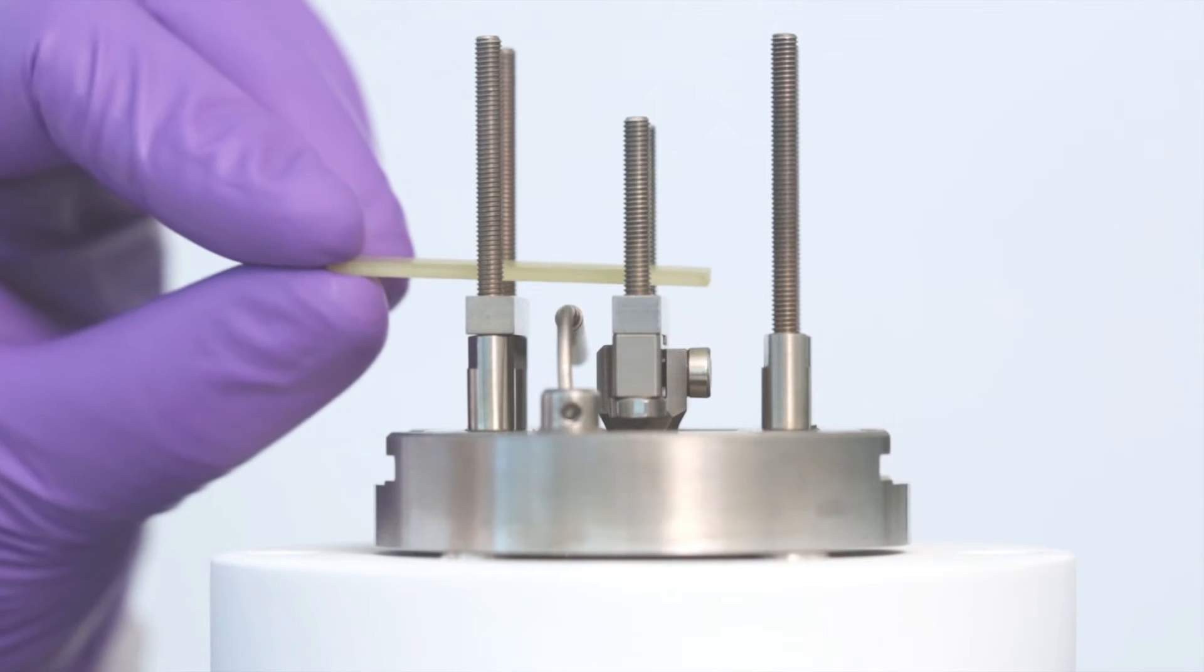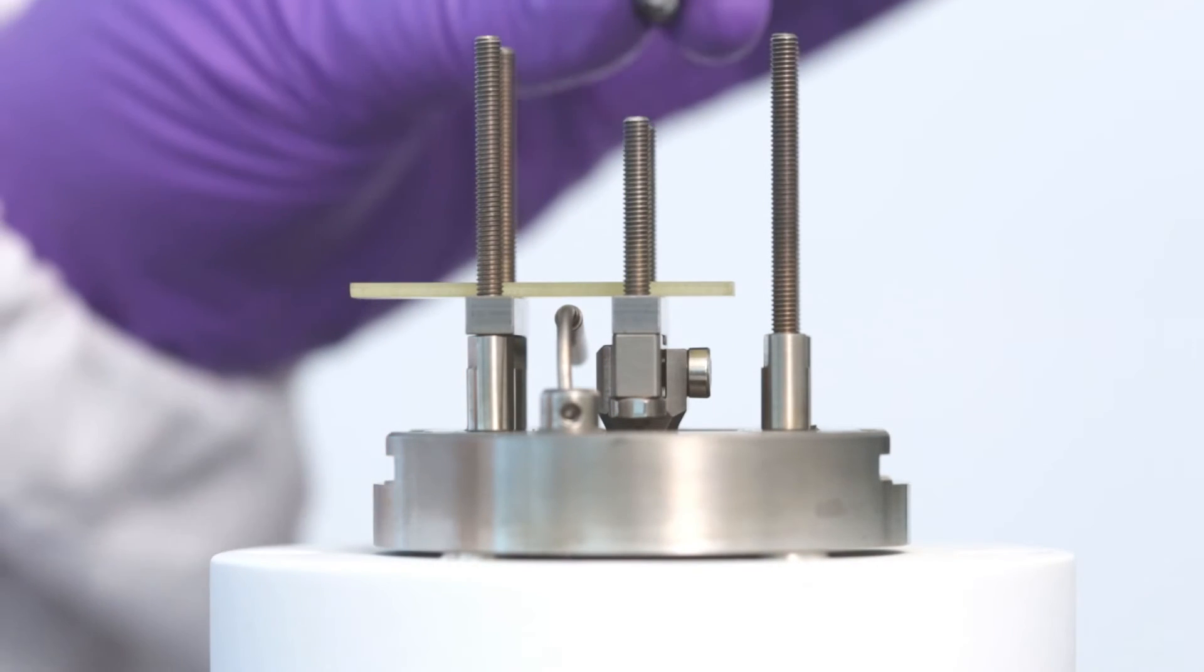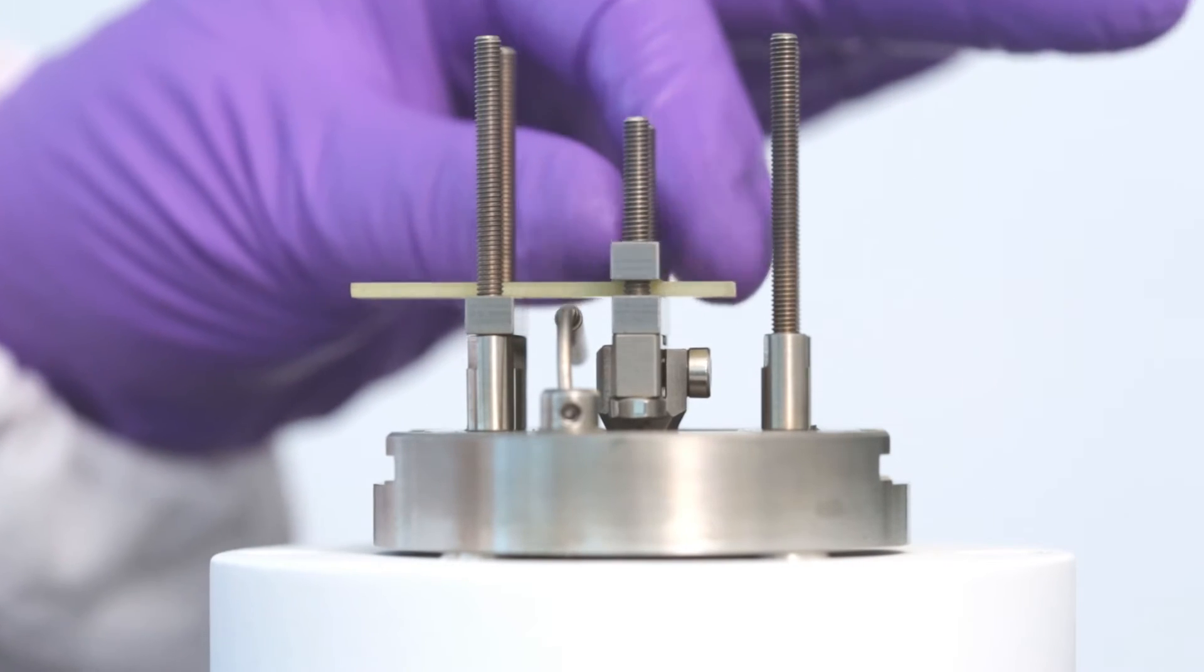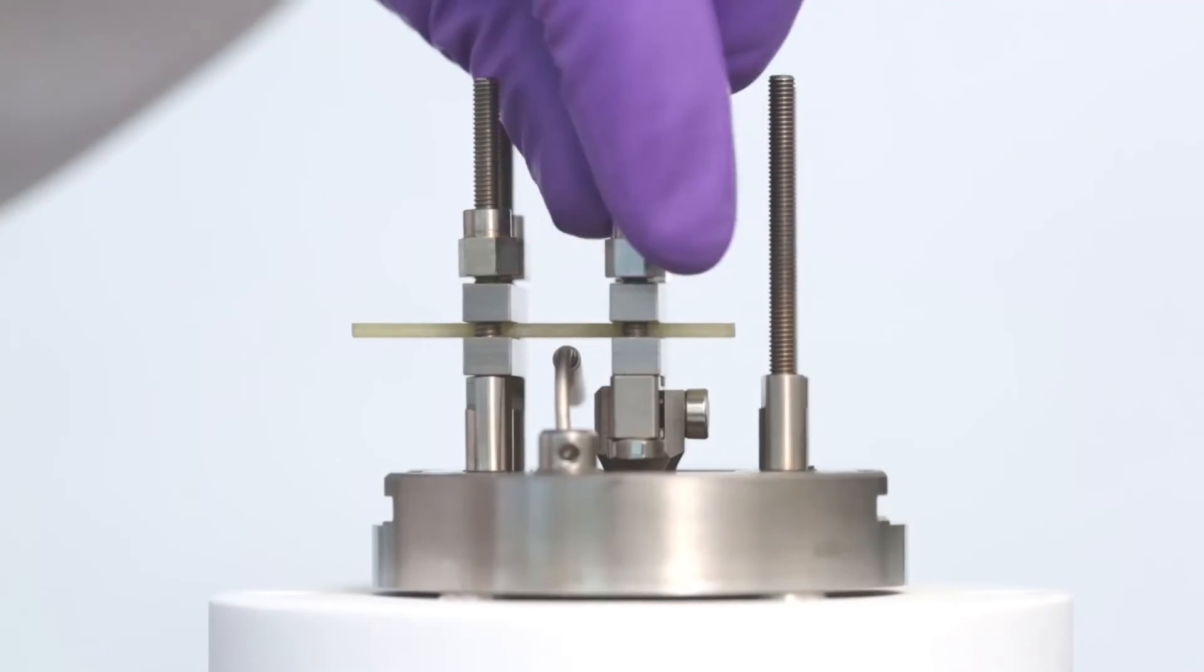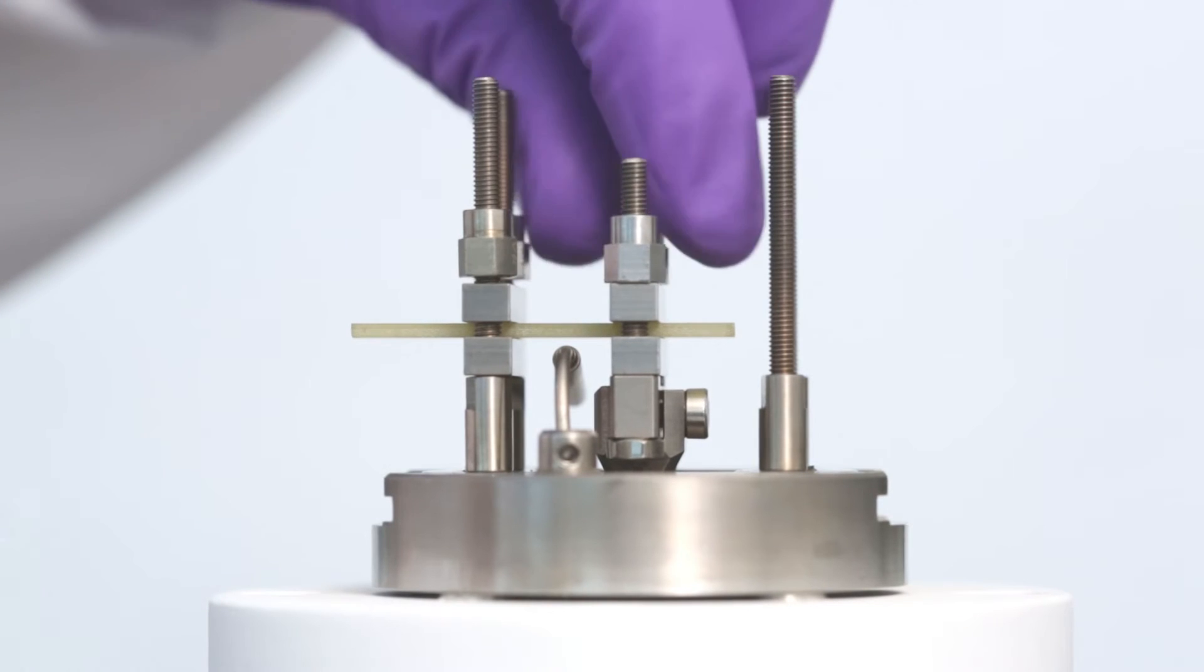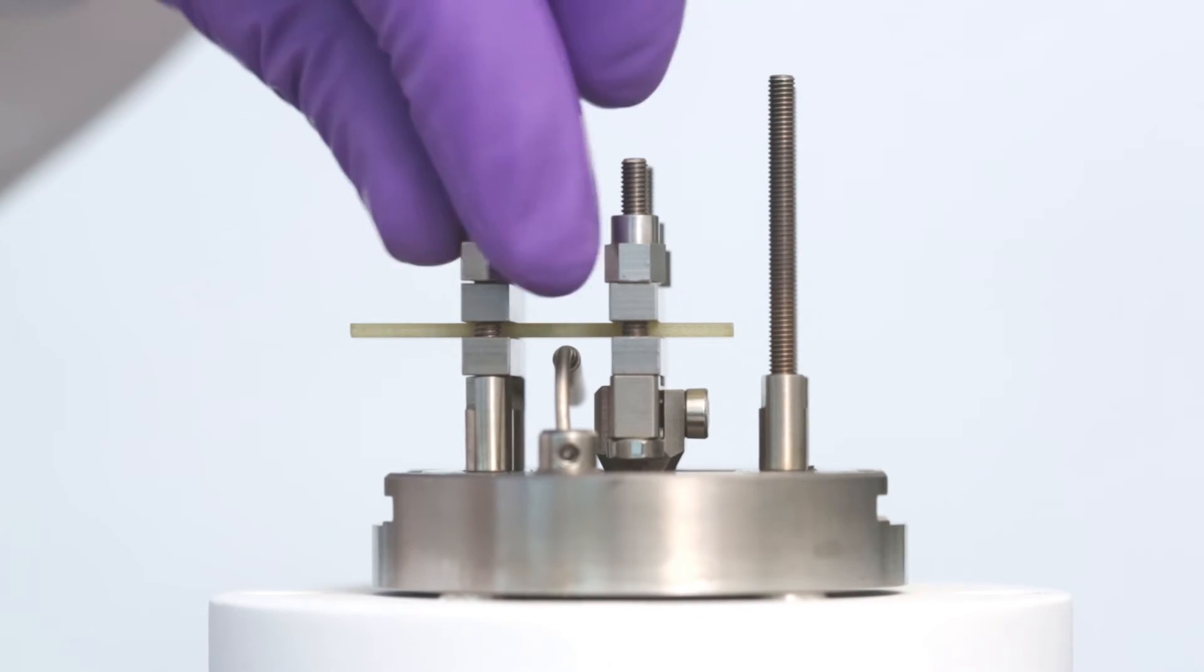Following this, we then place the sample on the clamp bars. Now, we can fit the upper two clamp bars. Screw on the four extended nuts and tighten equally so they are just finger tight.